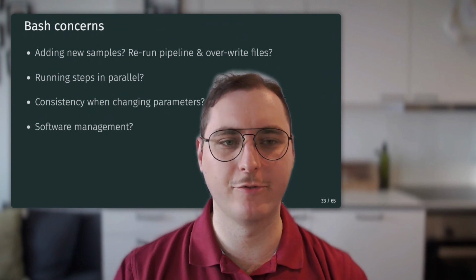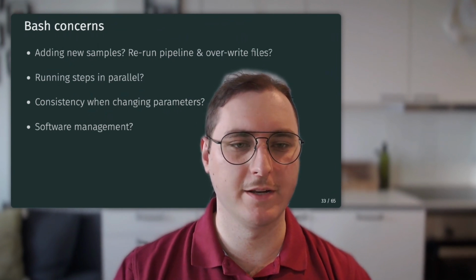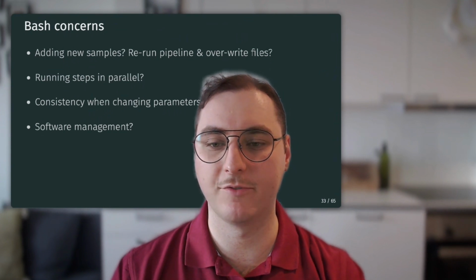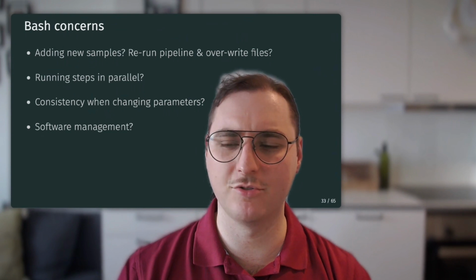Also in this for loop, if the samples are independent, we should be able to run that in parallel, either on the same machine or even in a cluster on a completely different node. With this bash script, it's not that easy to do.